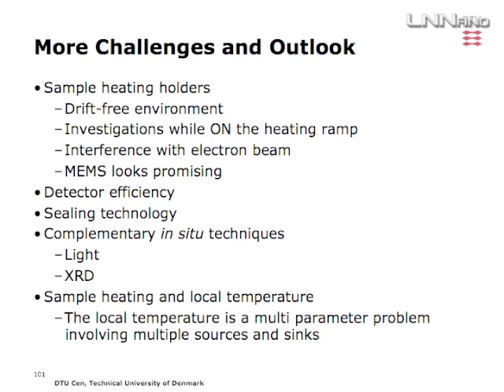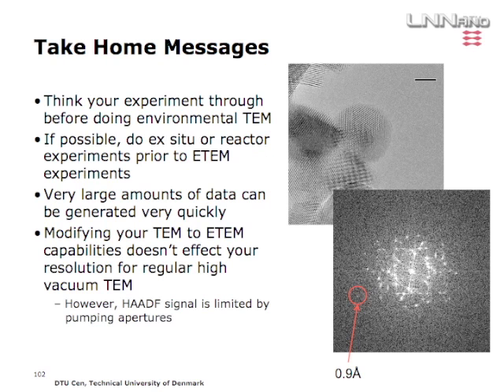You always need to do complementary in situ techniques to verify that what you're actually observing is the real deal. That's the same as before. Also, a couple of take-home messages. Think your experiment through before doing an ETEM experiment. Is it feasible to do it under the conditions and timeline that you have for ETEM?